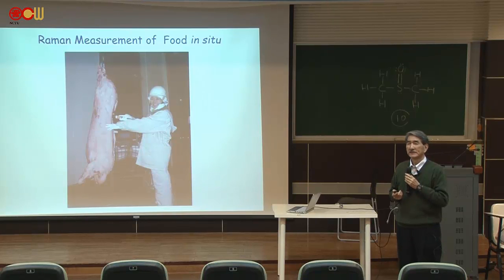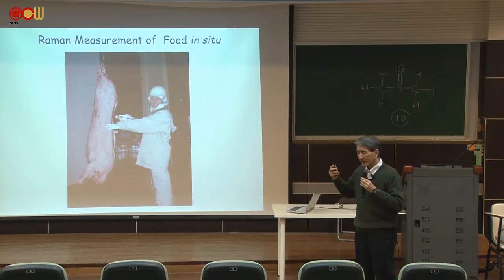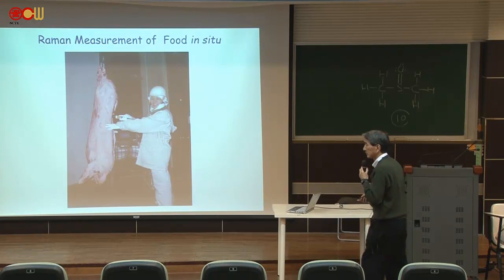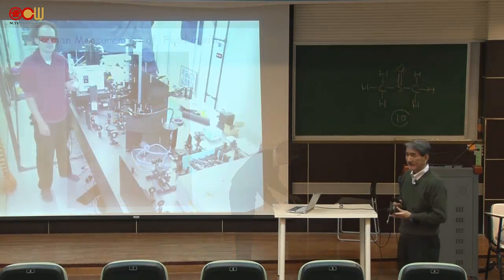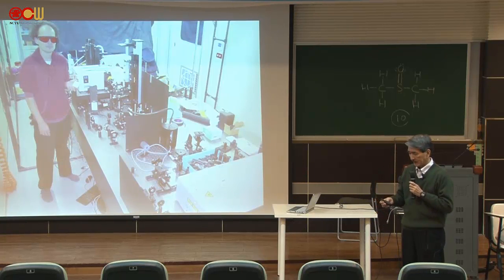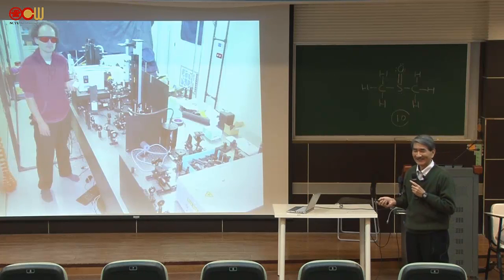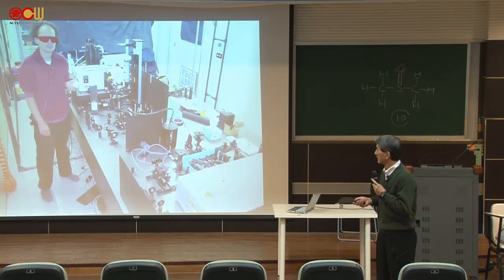Okay, so this is just a brief introduction to Raman spectroscopy, and now I show you how we do Raman spectroscopy by showing some pictures. This is one of the Raman spectrometers that we have in laboratory, the basement. And here you see the Russian mafia in a group. He's Vitaly Korepanov, a postdoc working for us.